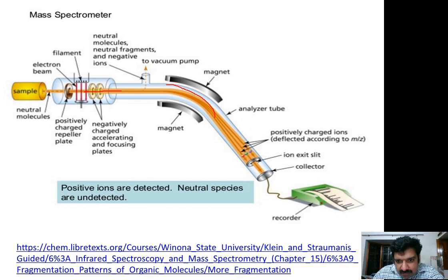So once here, an electric signal making screen is there. When the particle hits the screen, it will create an electric signal. That electric signal is amplified and given to the computer, which will plot the graph. From here we will get the mass spectrograph. And this one is known as the photomultiplier.